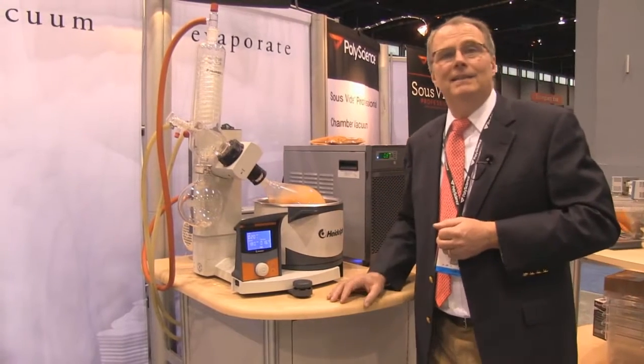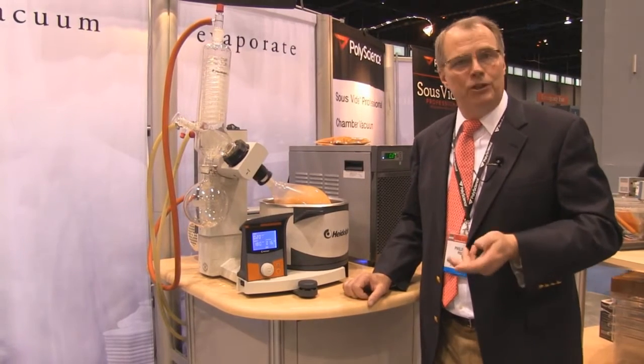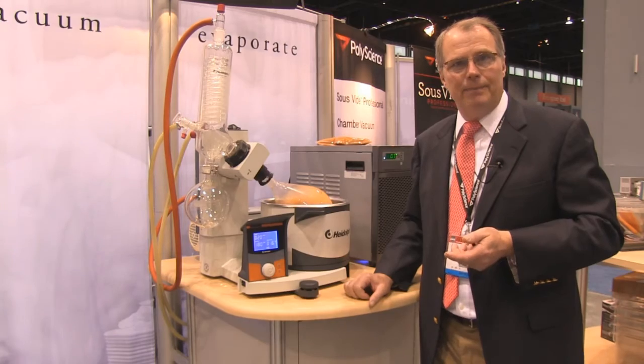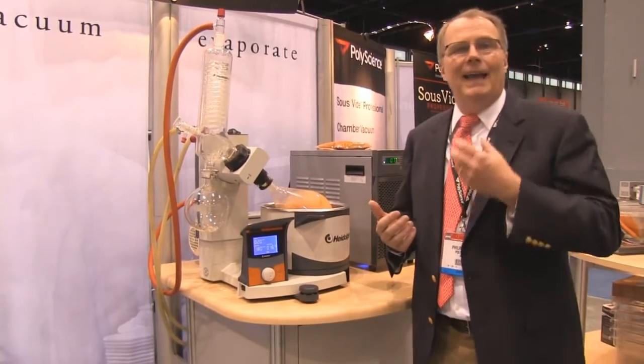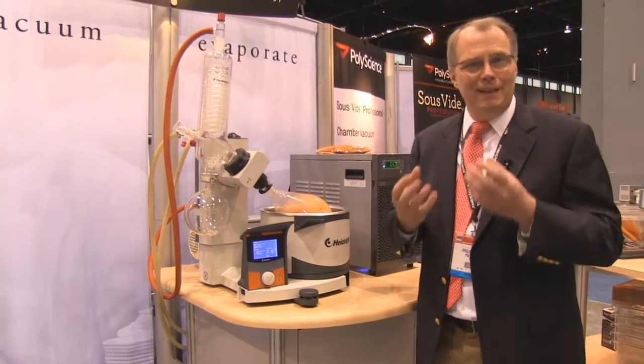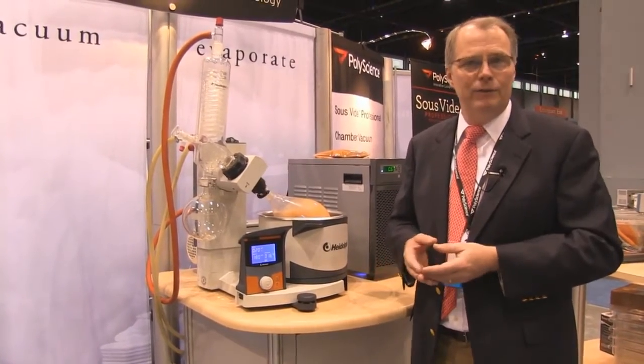This is the PolyScience Rotary Vacuum Evaporator Low-Temperature Distillation System. With this, you can distill products at very low temperatures, therefore retaining the very bright, volatile flavors.